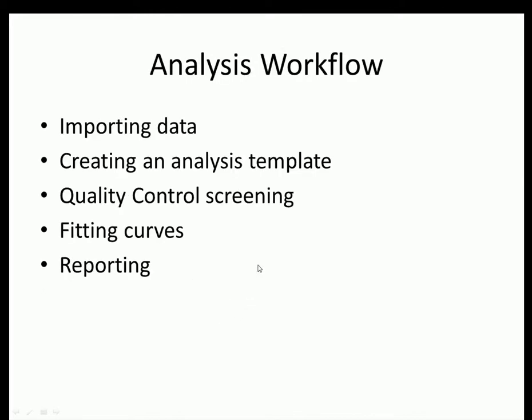Okay, so I just have one last slide here before we get into the actual application, just to give you an overview of what we'll talk about today once we get over into the software. I'll show you how to import a raw data file. We'll talk about creating an analysis template. We'll do some quality control screening. We'll fit the curves, obviously, fit and optimize our curves, and then finally generate some reports and graphs.